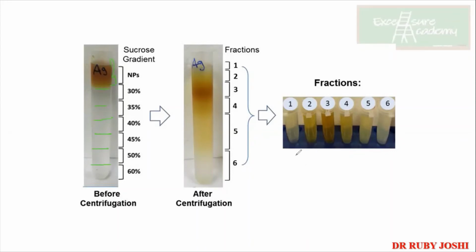Okay. After centrifugation, what do you see? Can you see the gradient difference? Right? So depending on this, you can see this is a clear portion. This is a little light portion. This is again another portion. This is a little dark, and again here. So, by density, I'm going to harvest using the pipette into different Eppendorfs. And later I can do the experiment to confirm whether I have got the mitochondria or ribosomes or proteins or nucleus. Okay. So this is how your gradient centrifugation works, and it helps in the purification of organelles, mainly based on the density.